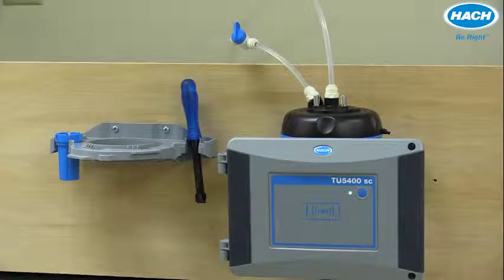If the sample temperature is between 2 and 40 degrees Celsius, the maximum pressure allowed is 87 psi or 6 bar. With warmer temperatures between 40 and 60 degrees Celsius, maximum pressure is 44 psi or 3 bar. If sample pressure exceeds the levels discussed in the manual, please install a pressure regulator.